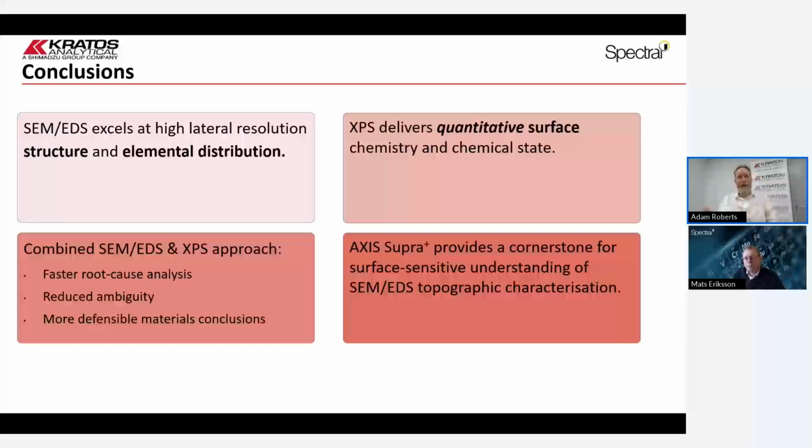So there are a set of calculated relative sensitivity factors, which are determined by the physics of the photoemission process.